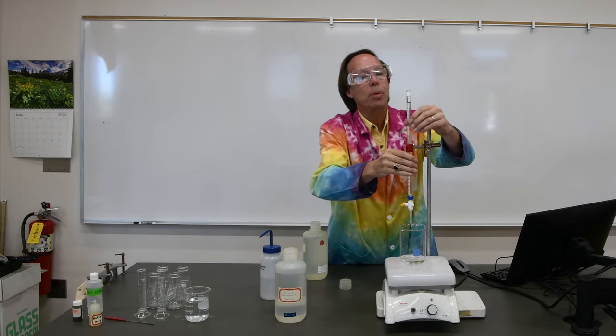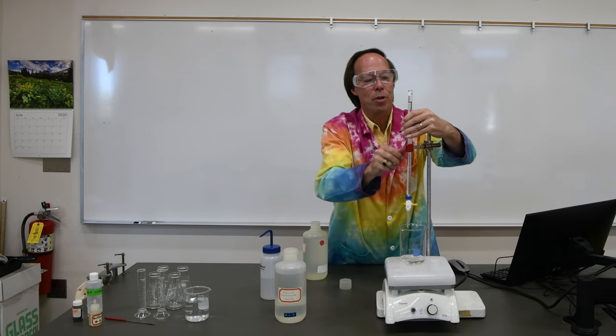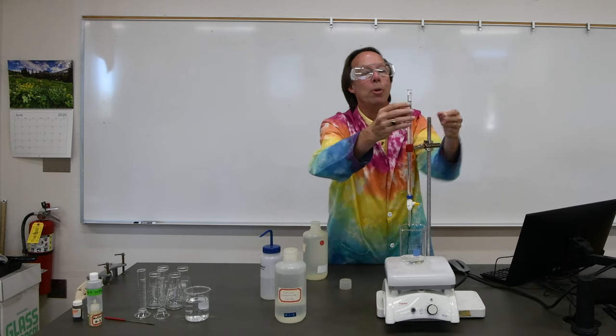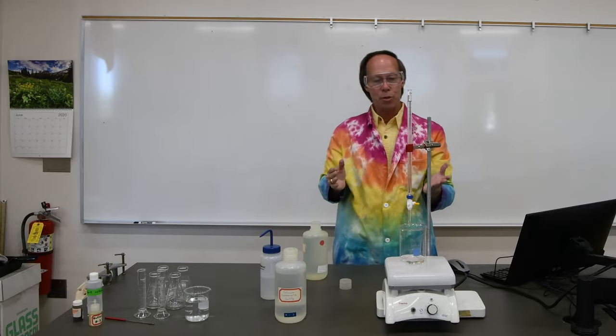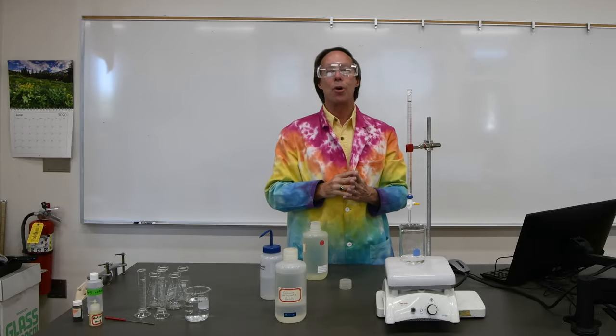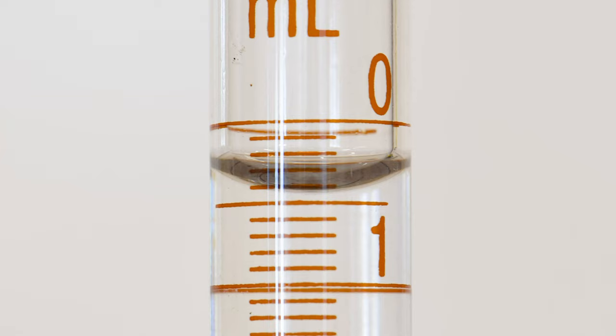And then whatever the reading is, that can be our initial value. So if I look at this, I'm going to read the burette like I would read a graduated cylinder. And I'll show you a close-up of this in a moment. But it appears that we are at 0.4 milliliters, that will be our starting point. This is the initial volume of the EDTA in the burette. Take a reading and record the value in your lab book.